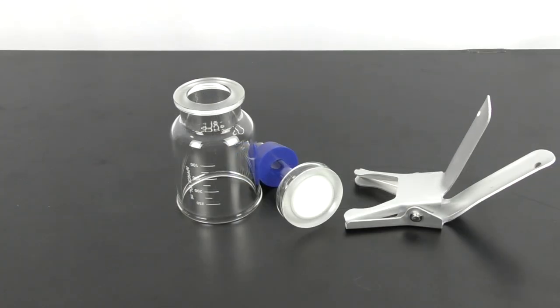The set includes a borosilicate glass funnel and base, an anodized aluminum spring clamp, and a perforated silicone stopper size 8.